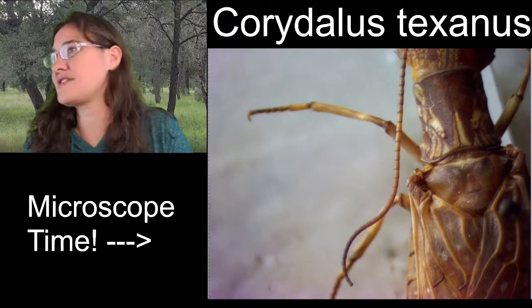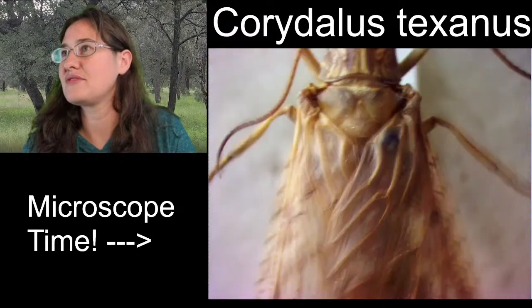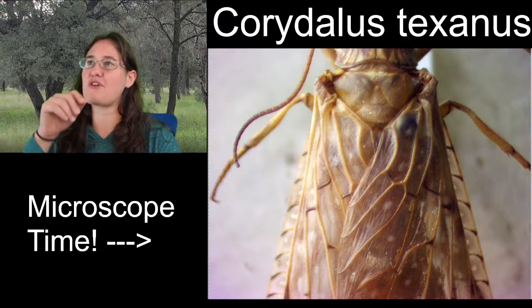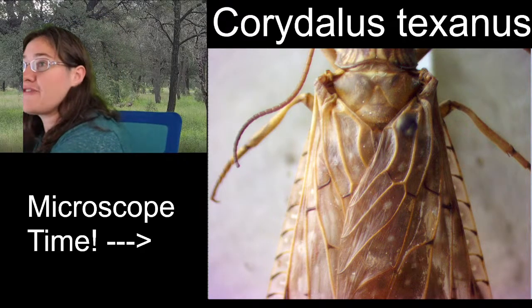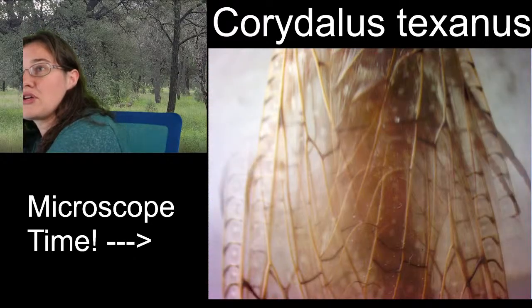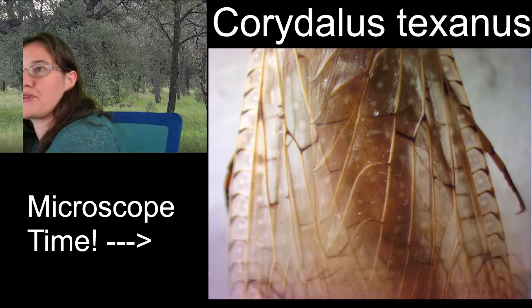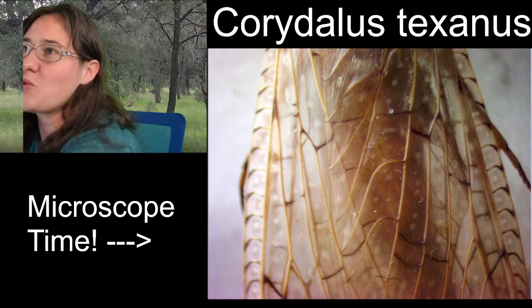So let's see. We have this portion of our wing here where you have all of the forks. It's up here closer to the top. And then if we just shift this down once to right about there, that's about halfway through. It's widening a little bit.